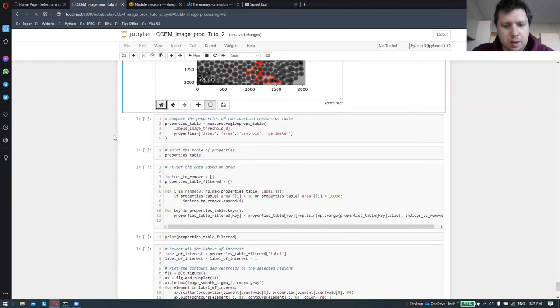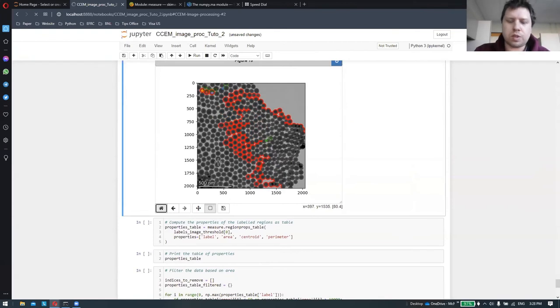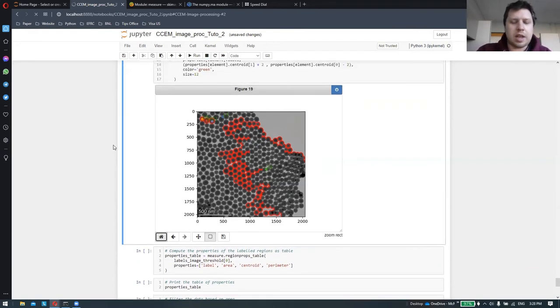In the following, to conclude, you might see in this set of results that you're not happy including in the statistics those elements like label 19 and label 17, and you would like to remove them. The good part is that, since you are dealing with a Python script, you can customize the elements that you want to analyze and discriminate them from each other, putting a criterion that you want to use. The idea here would be: why not use the area as a way to discriminate all the elements that have been labeled?